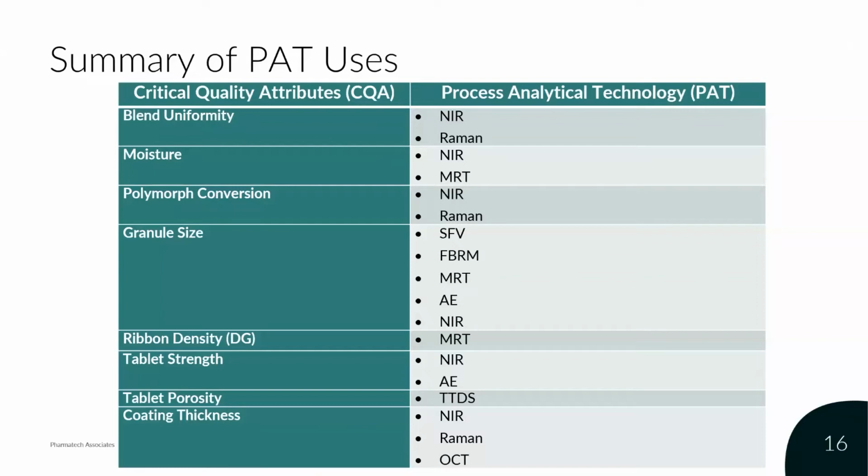All of these things we can nail down with process analytical technology. And based on that, we can reduce the amount of time that it takes to test these in the lab. We can release them using our process analytical technology data. We do not have to take another sample and then send it to the lab. So these technologies and probes, if you will, when properly calibrated and coupled with chemometrics, provide quality data for real-time release testing, either online or at line or inline.